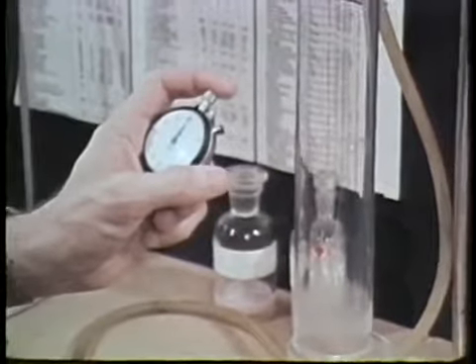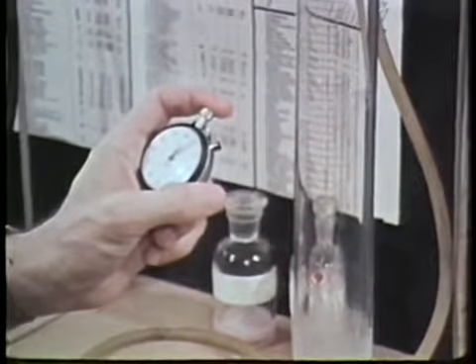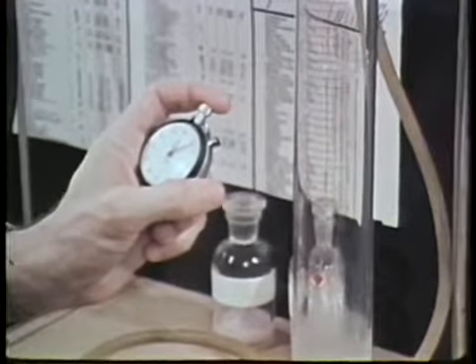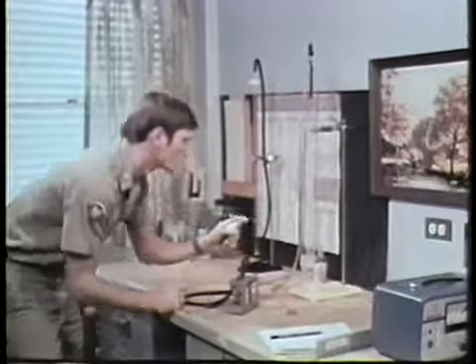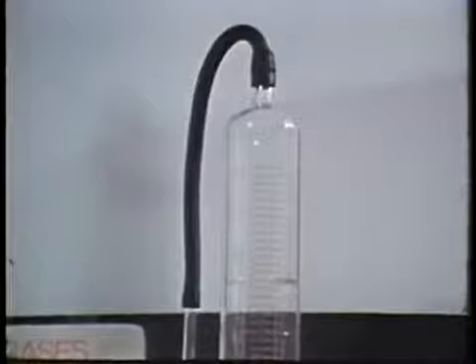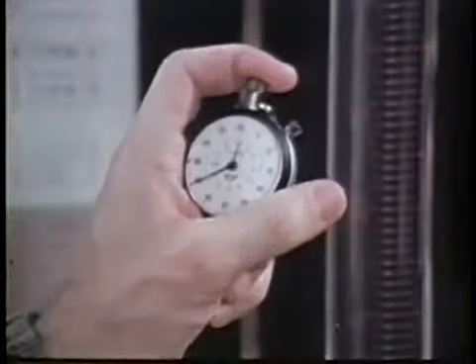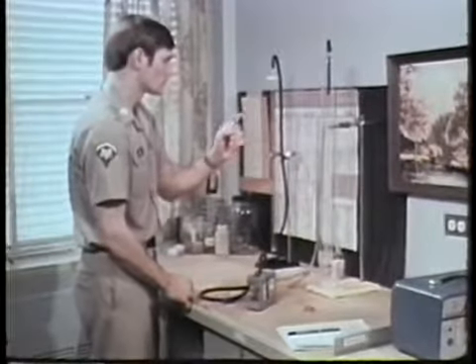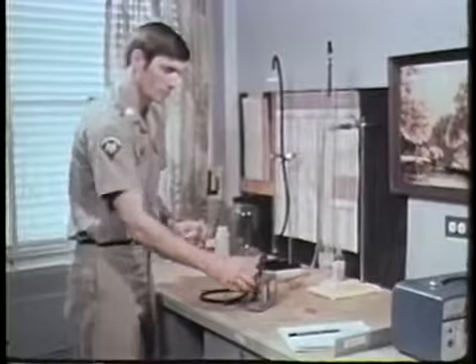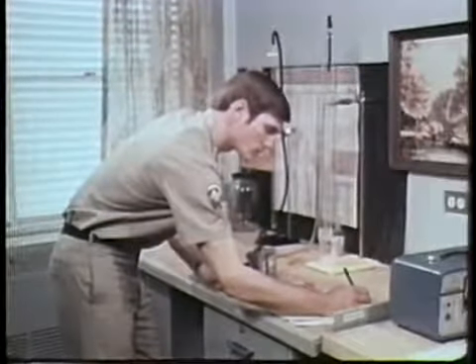The time it takes the soap bubble to travel the length of the burette is used to figure the flow rate for each different ball setting. Enter the corresponding flow rate for each ball setting on the data form.